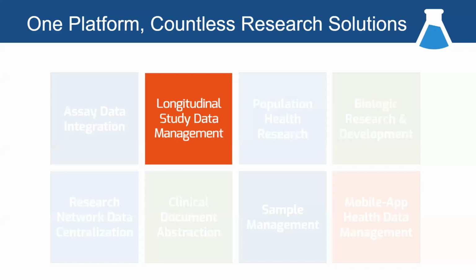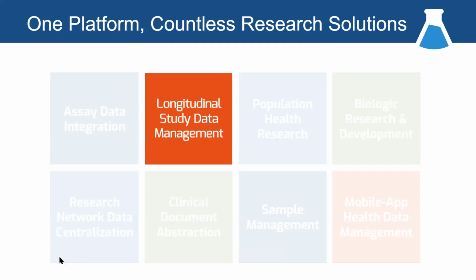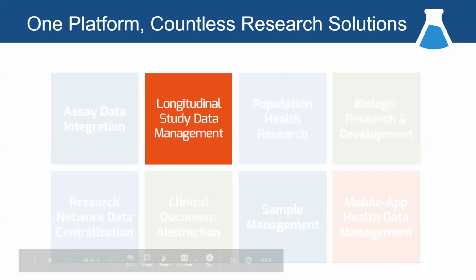One of the most advantageous applications, one of the key strengths of LabKey Server, is around the longitudinal study data management area, where LabKey is particularly good at the integration, the management, analysis, and the secure sharing of study data, clinical study data, where uniquely, in many ways, LabKey can tie together demographic data, phenotypic data, clinical data, laboratory data, specimens, and numerous different assay data at the participant level. And so today we'll be looking at LabKey for research study data.